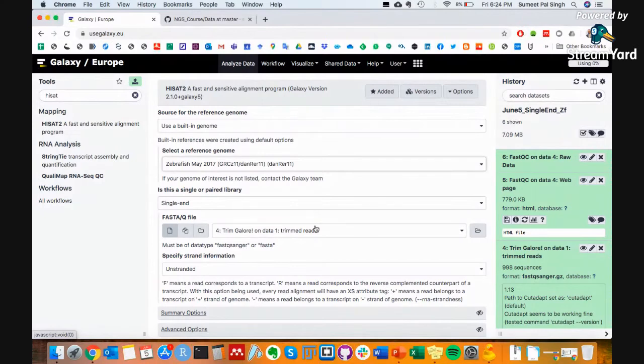And this is important because the genomes between Ensembl and UCSC are different, and so are their corresponding transcriptomes, right? Therefore, whenever you want to refer to any location, and if you're using Galaxy, you have to go to the UCSC website, not the Ensembl website.